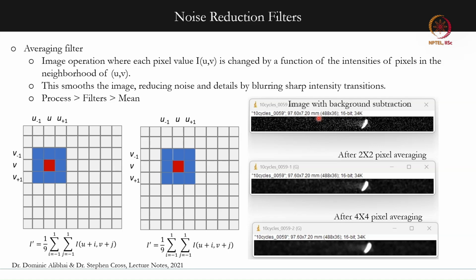Here we are going to use filtering techniques, and we'll use two of them. One is the averaging filter and the other is a median filter. In the averaging filter, the function creates a bounding box and then changes the pixel intensity values at all pixels in an image. Here I have shown a schematic of a 3x3 averaging filter.